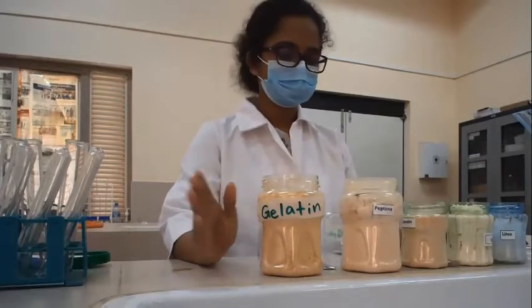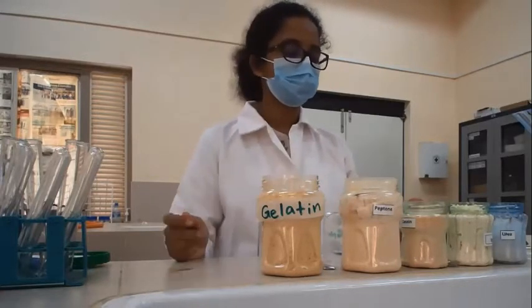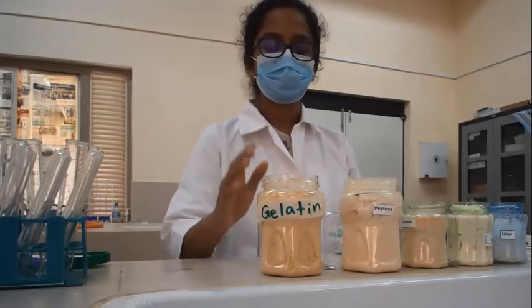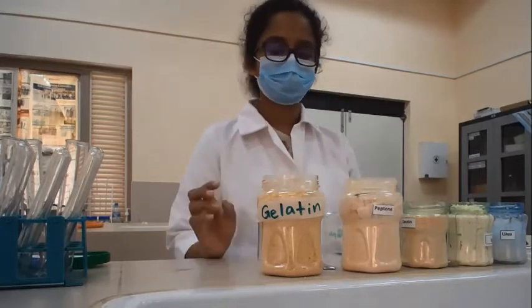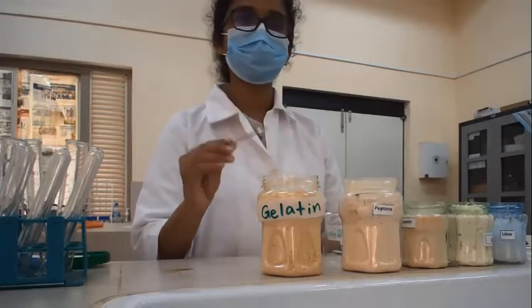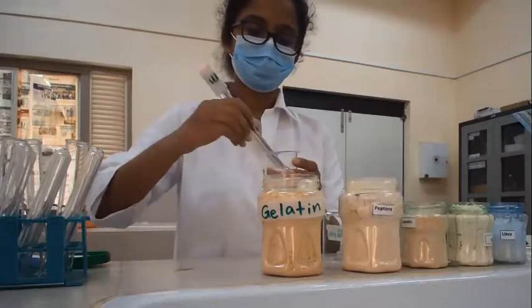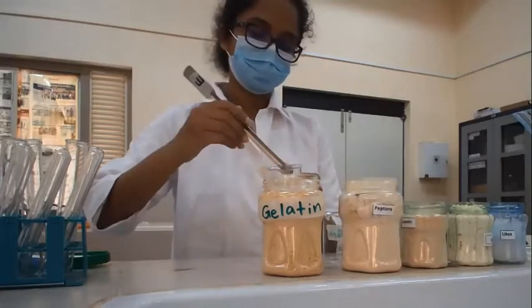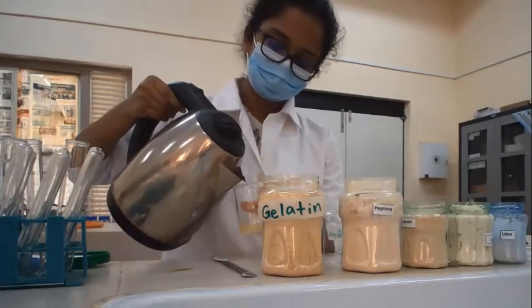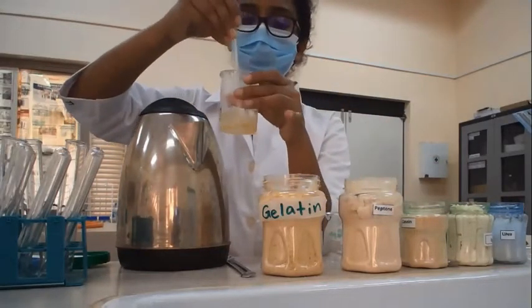Today our practical is the identification of protein. For that we have some samples of gelatin, peptone, casein and albumin. Before we start the experiment, we have to make a sample solution from each of these given samples. For that we are going to take a small amount from each sample, add hot water, and make a suspension. And we are going to dissolve it using a glass rod.